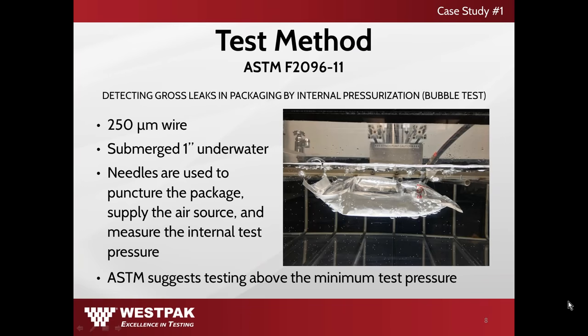In order to ensure sterile integrity, gross leak detection outlined in ASTM standard F2096 will indicate any comparable factors of the sterile barrier system. By taking a 250 micrometer wire, a control sample is punctured and submerged one inch under water. Needles are used to puncture the package, supply the air source to inflate the package, and measure the internal test pressure. Once the test pressure indicates the known failure, the remaining pouches will be tested 0.1 psi above the known failure test pressure.